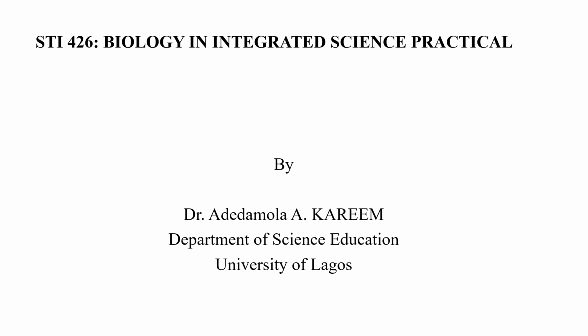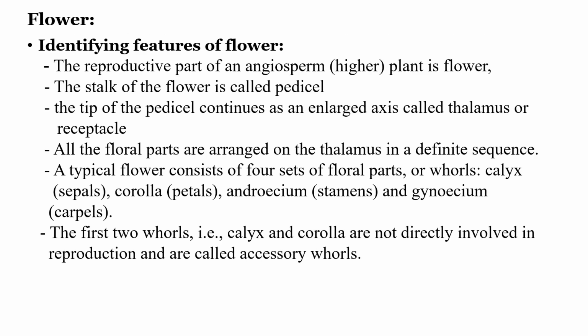Today we shall be looking at the flower. The main thing we're going to look at is the flower as the reproductive part of a plant, especially the reproductive parts of an angiosperm plant. We're going to look at the parts of a flower.